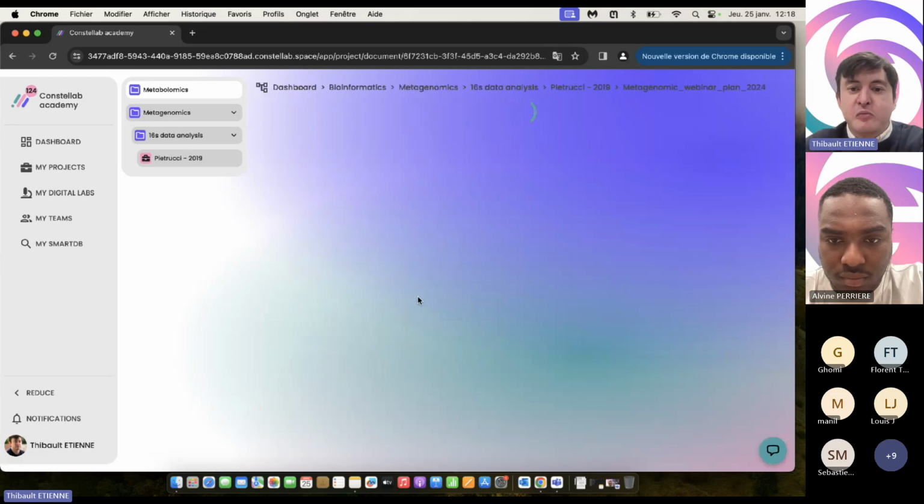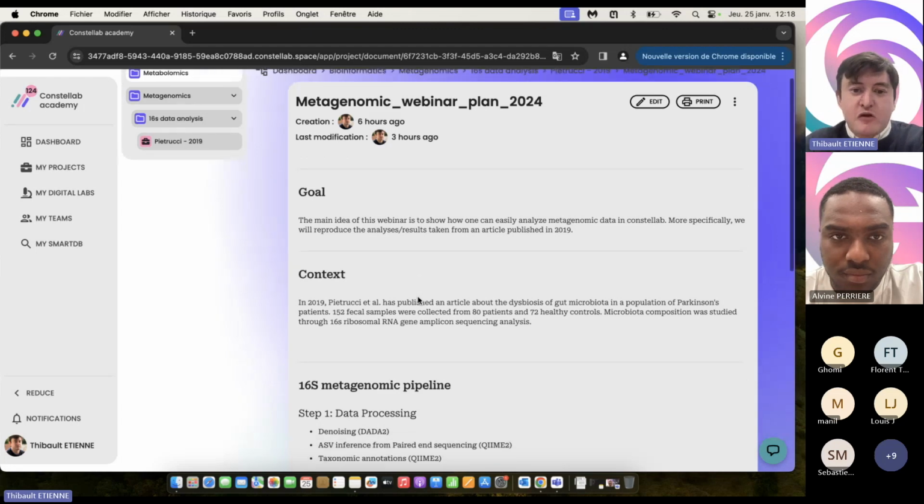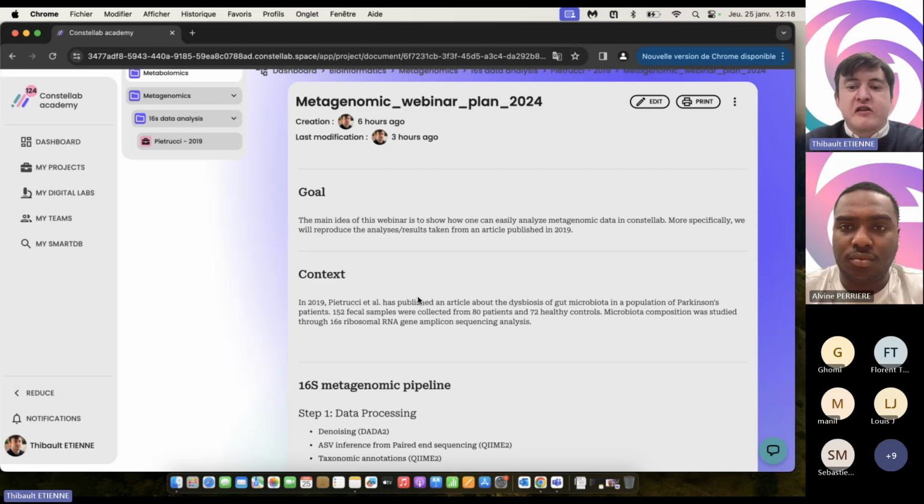This is a document to present the plan of the webinar. The main idea of this webinar is to show how we can easily analyze metagenomic data in Constellab. More especially, we will focus on reproducing the analysis and results taken from articles published in 2019.